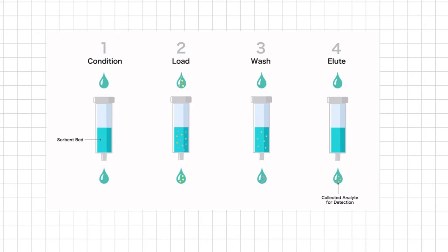Solid phase extraction is conducted by following these steps. The first step is called the conditioning step. Second is the sample loading step. Third is the washing step. And fourth is the elution step.